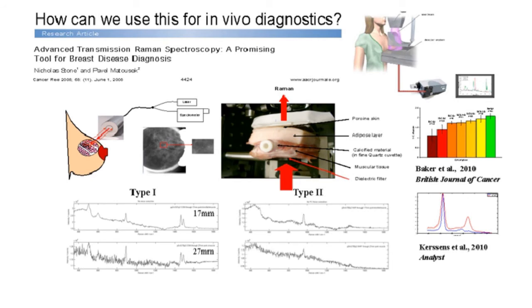And in this example here, we've demonstrated by using these spectra that we have along the bottom are measured through a large piece of pork joint with an insertion of calcifications within those. This is having protein-rich and fat-rich and skin tissue, very much like a breast phantom, and demonstrating that we can separate the type 1 and type 2s effectively.